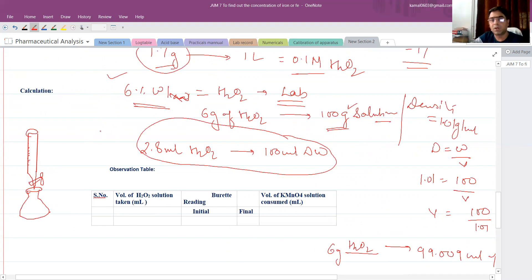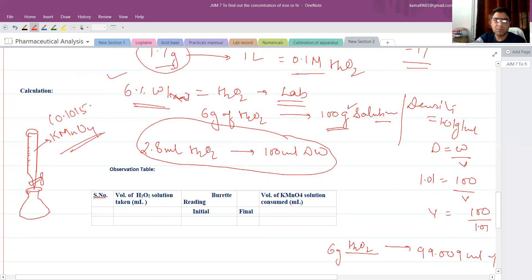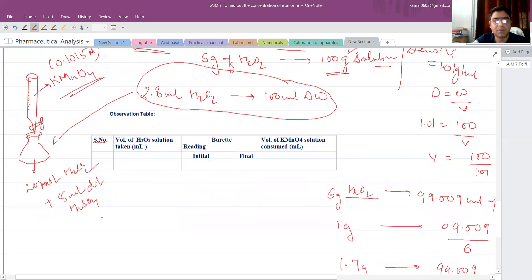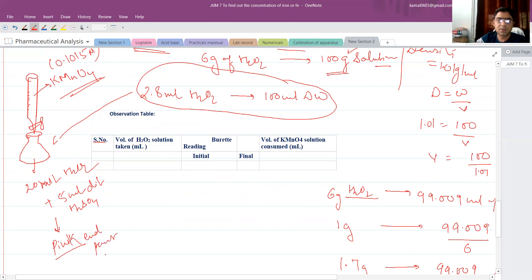Take the pre-standardized KMnO4 solution from the previous experiment, whose normality has already been determined as 0.1015. Fill this solution into the burette. Take 20 ml of the H2O2 solution in a conical flask, add 5 ml of dilute H2SO4, then titrate until the pink color endpoint is obtained, since KMnO4 acts as a self-indicator.